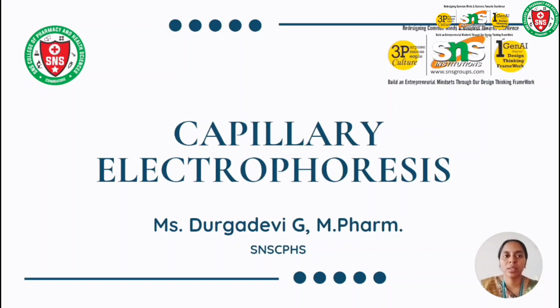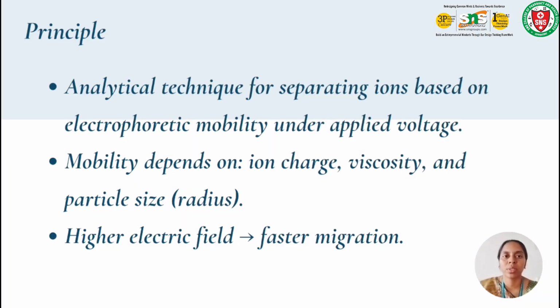Hi everyone, in this lecture I am going to talk about capillary electrophoresis. The principle involved in capillary electrophoresis is electrophoretic mobility as well as electroosmotic flow. Electrophoresis is something that happens under the influence of electrical charge. Phoresis means migration of ions.